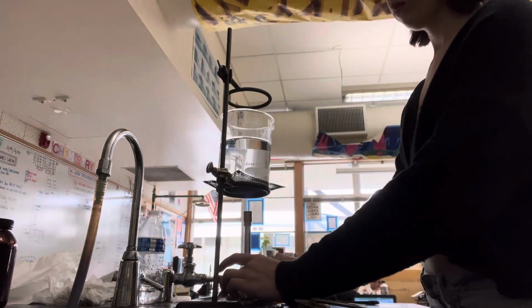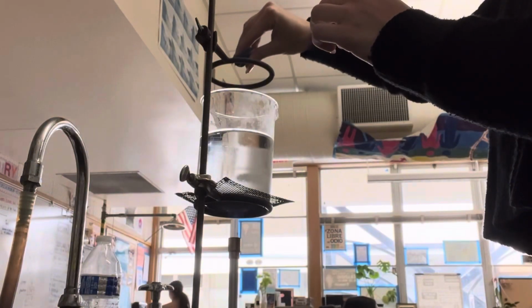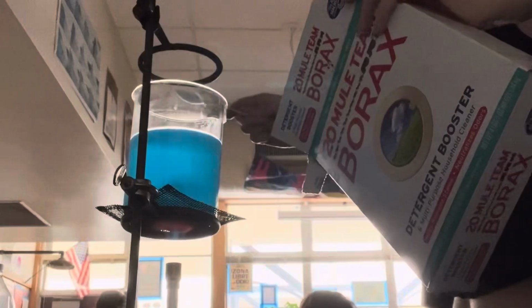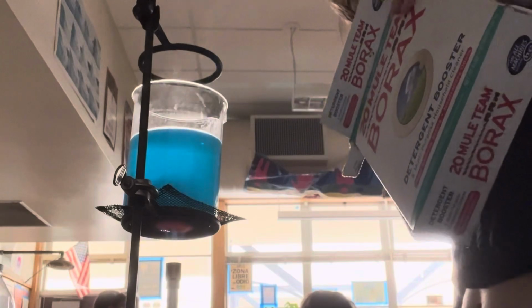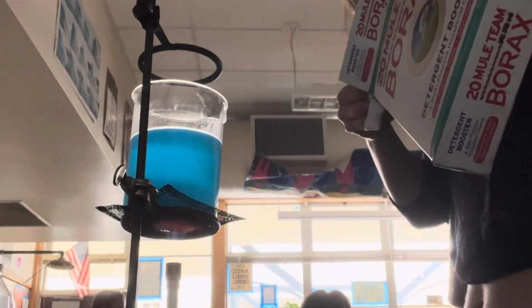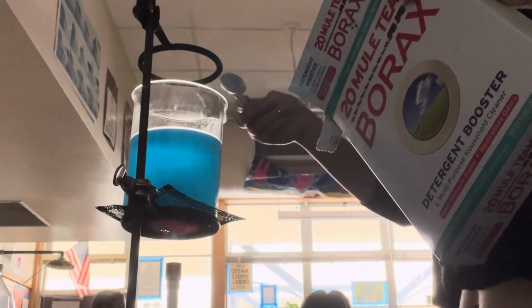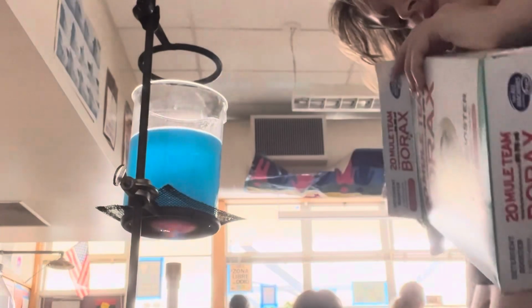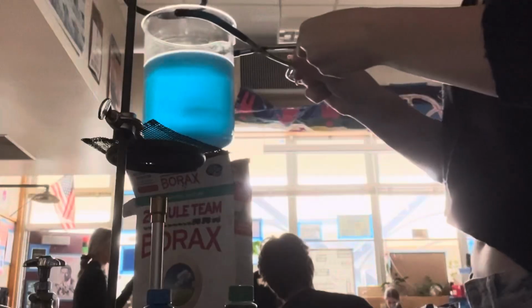Then I lit my Bunsen burner so that I could start boiling the 3 cups of water in the larger beaker, and I added 2 drops of blue food coloring. I was hoping that this would make the crystals colored when they crystallized, but it didn't end up really doing much. Then I added about 9 spoonfuls of borax into my water, and I did this because it called for 3 spoonfuls per 1 cup of water, so 3 times 3 equals 9. After it boiled, I took it off the heat, put my snowflake in, and set it aside to cool.